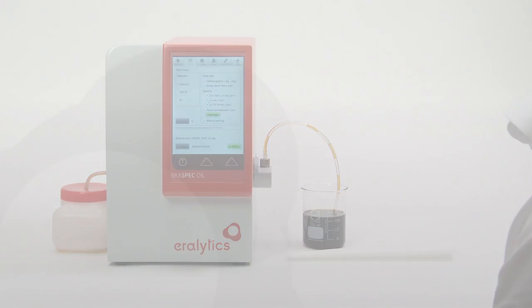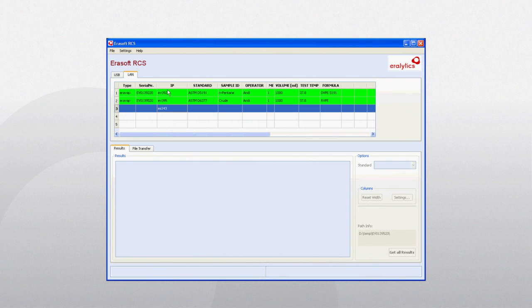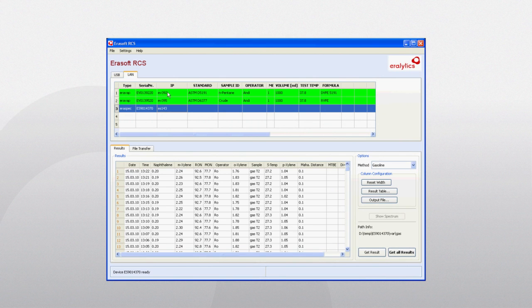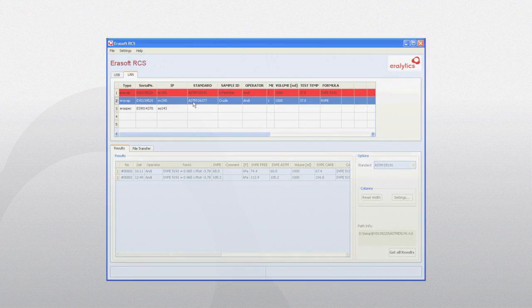A very convenient alternative is the automatic transfer of data to a LIMS system. There is no software required — just connect the instrument to the local area network via the built-in Ethernet connection and define the folder and file name where the results shall be stored. Remote control, data transfer, software upgrade, result review, and much more is possible with the Errlytics Errorsoft RCS software.